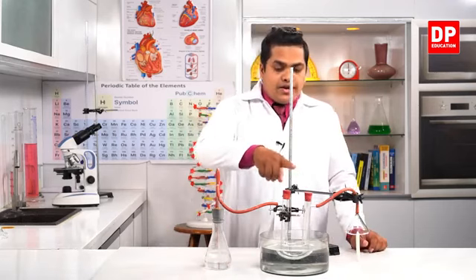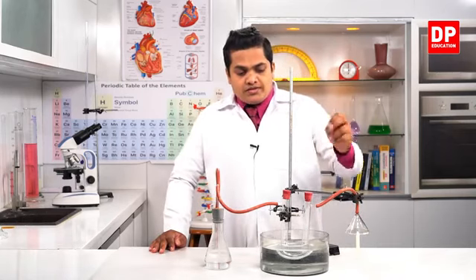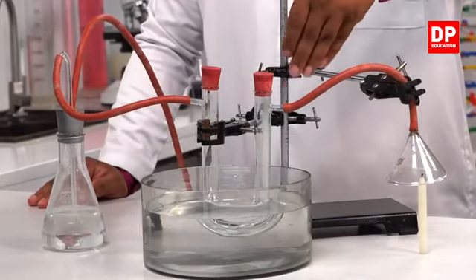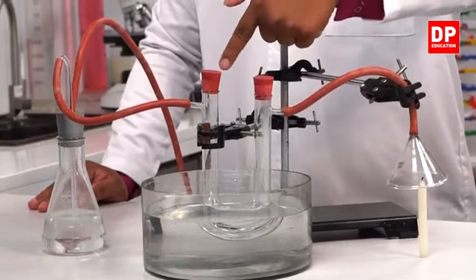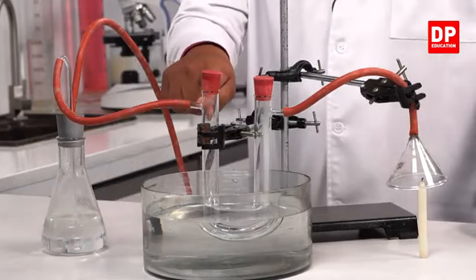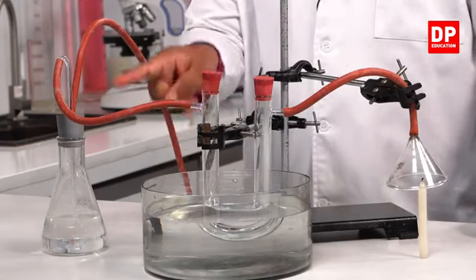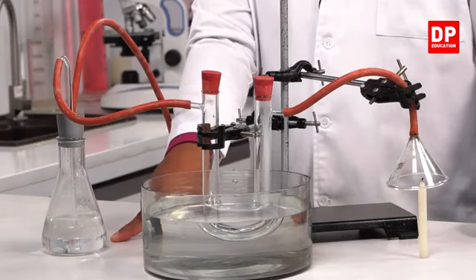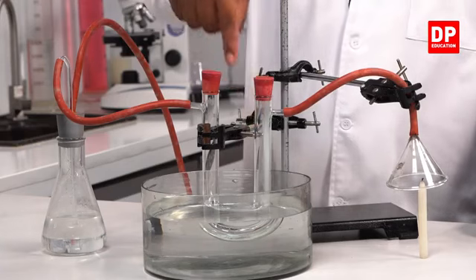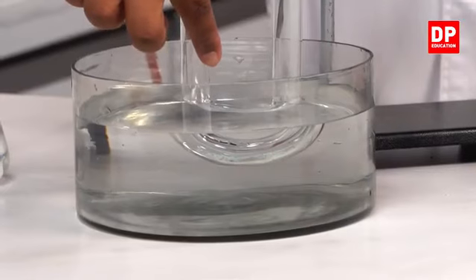At the two ends I have applied stoppers so that the gas which is coming from here goes through to the next arm, and exits from the nozzle here towards the other vessel which is here. Inside the U tube here you can observe there is a certain chemical.